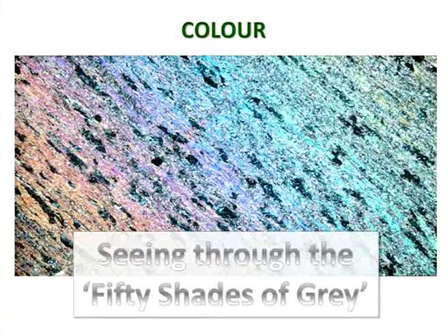Sometimes they can be very useful, but the trouble with them in petrography and a petrographic microscope is you can't tell anything much else about them. All you can look at is the shape and the fact they're black, and that's it. That's not to be confused with minerals such as garnet, which are isotropic and which are colorless or some kind of color in plain polarized light, but go black when you put the cross polars in.